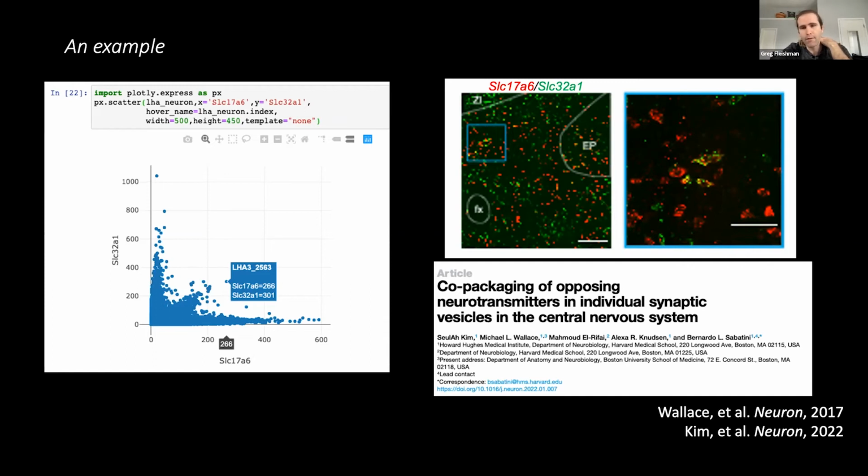Mm-hmm. But even in our best prepared samples, we see a similar type of population with a little bit of mixing, and there's single cell RNA-seq data in zebrafish brain to support it as well. Yeah, that's interesting to hear.